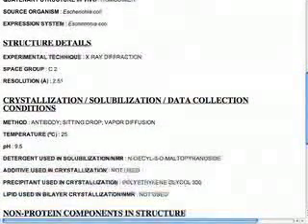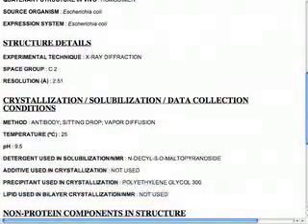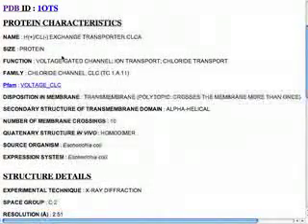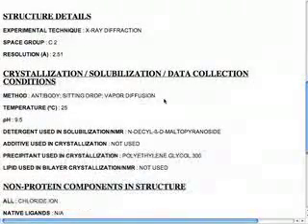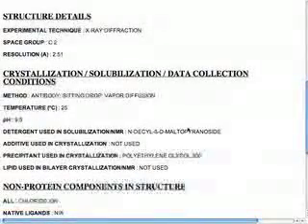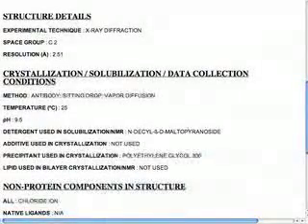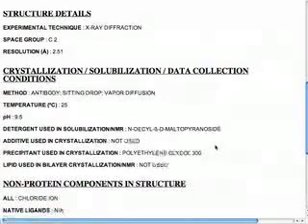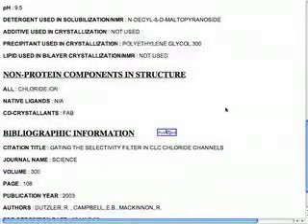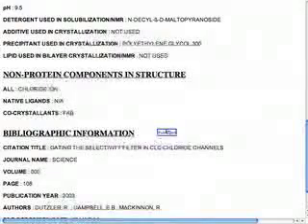For example, here I'm informed that 1OTS, which is the crystal structure for the proton chloride exchange transporter from E. coli, basically used a detergent n-decyl-beta-D-maltopyranoside, PEG-300 as a precipitant, and it gives you the other information connected to this crystallization experiment.